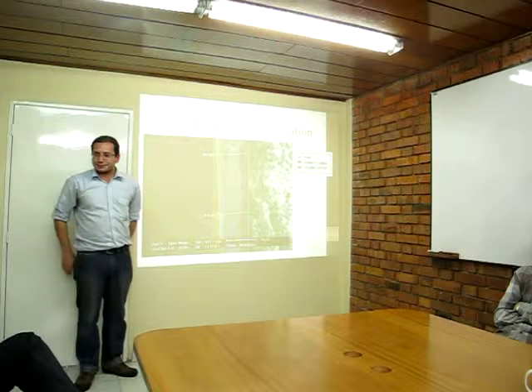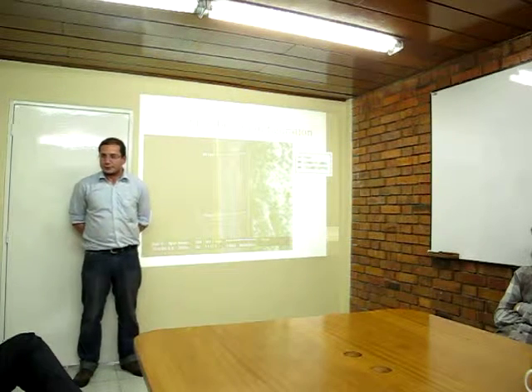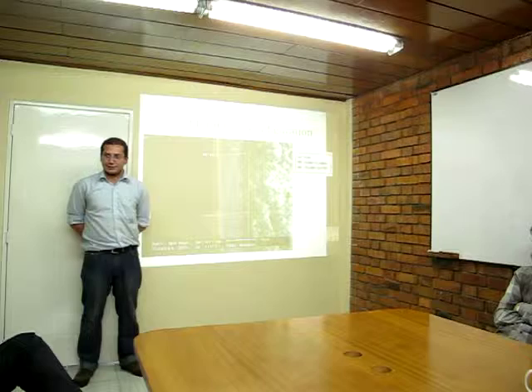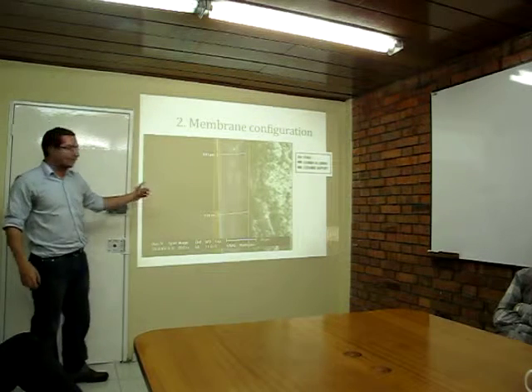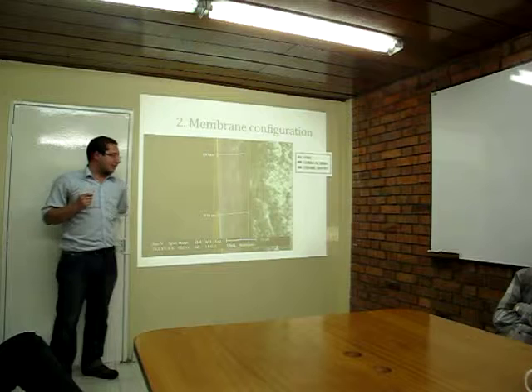But what is the characterization? You prepare the characterization, for example, with scanning electron microscopy.